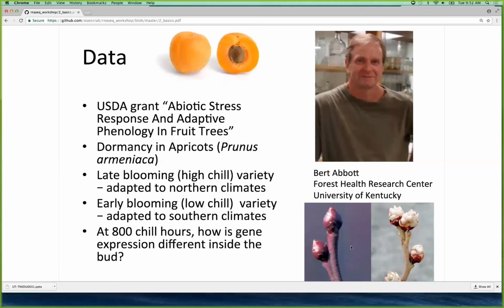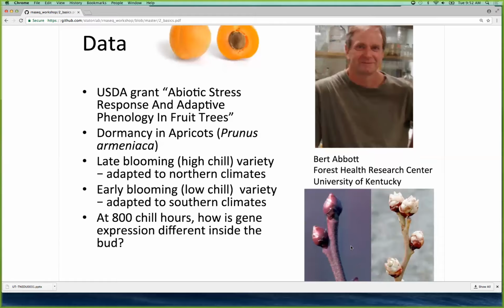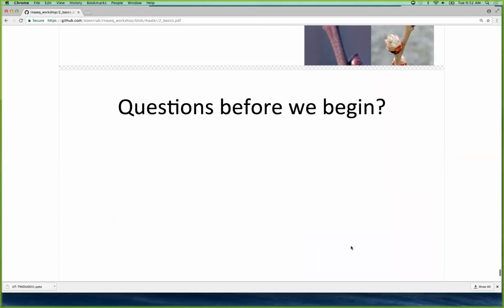And this is Jiali's first PhD project. So I'm sure she'll be excited to get all this help on her project. We have sampled the data down to 250,000 reads, so it'll run really fast on Beacon. But we actually have tens of millions of reads across the different libraries. So this is a small subset, but should be interesting to work on.